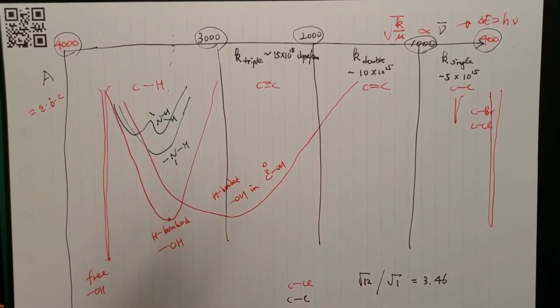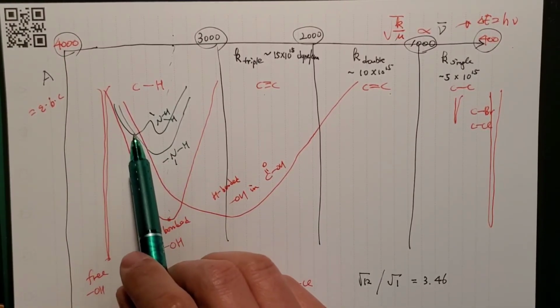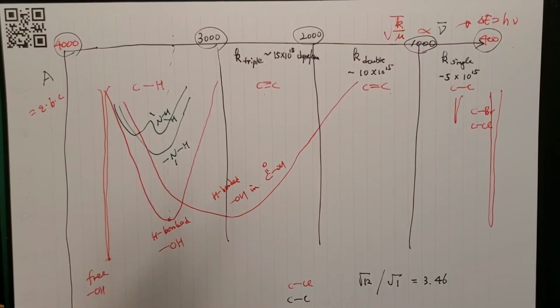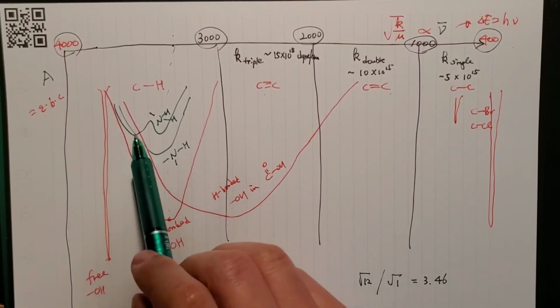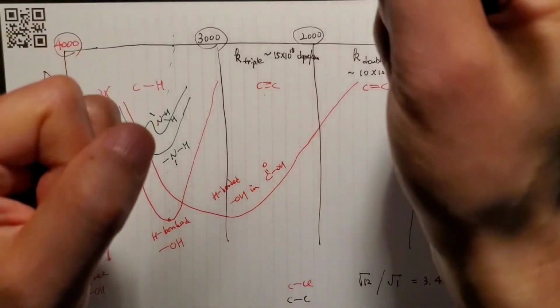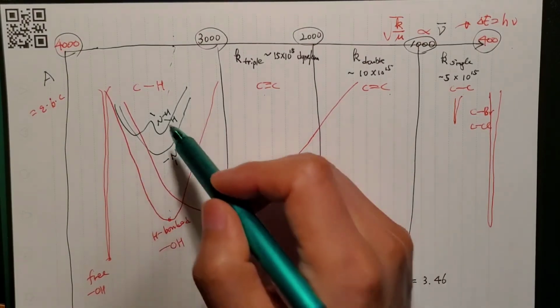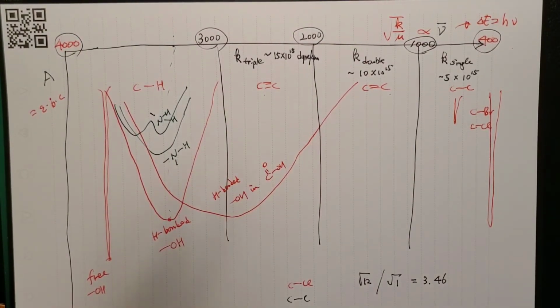vibrational modes, like the CH2 we talked about, and some of them show intense signals and some of them do not. So one of them turned out to be the asymmetric stretching vibration of NH2, the other one a symmetric vibration. The asymmetric stretching vibration will be like this, two hydrogens going like this while they're attached to the nitrogen, and the symmetric ones are going like this, right? So those are the two modes made by the three atoms.